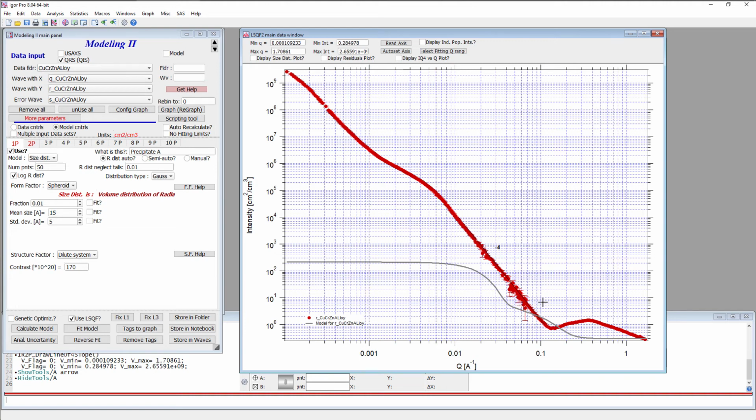Now, it would be interesting to find out what the scattering of this is. We never went in there, and clearly there are some other parts of the microstructure, except the user simply gave up the moment they figured out their favorite particles which they need to see is impossible to see using small angle scattering. They basically disappeared and went after another technique, which is probably the right thing to do anyway. Small angle scattering cannot answer all the questions in the world, so you have to pick the ones which you can get answered from that and find other tools if you need them.